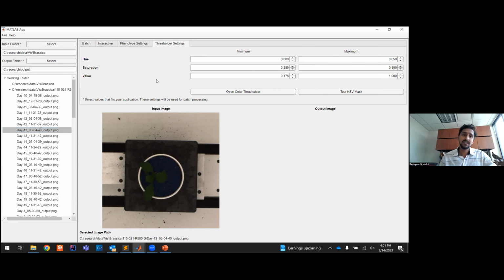To keep it simple, we just choose one modality. There are multiple modalities, like Shruti explained how thresholding can be done. It could have multiple color spaces.